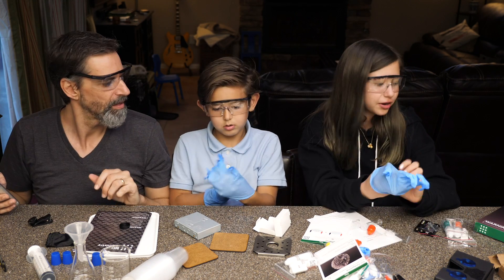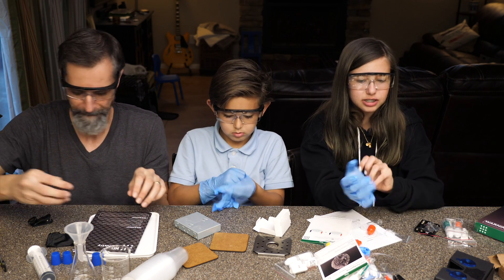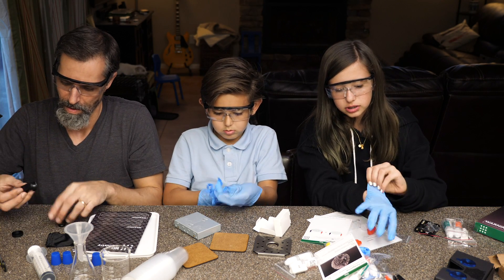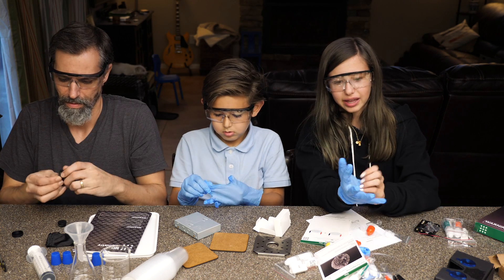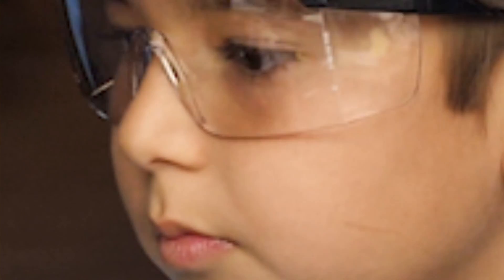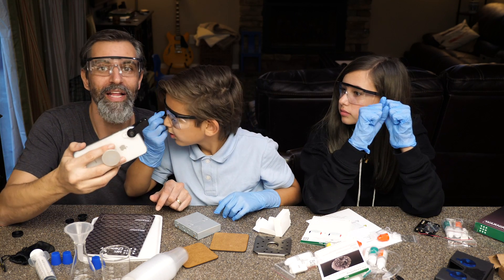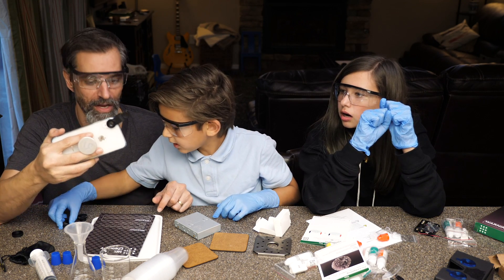Are we making crystals? Yeah, we are. I'm guessing this is going to be the type that takes a while to grow the crystals, so we'll have to check back in. Oh, this is a macro lens right here — so this lets you get really close to objects. This is so we can look at the crystals up close. Hey Dad, there's multiple.